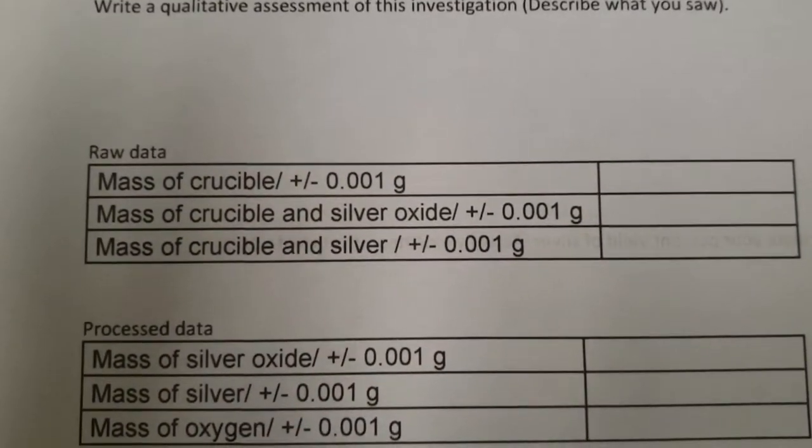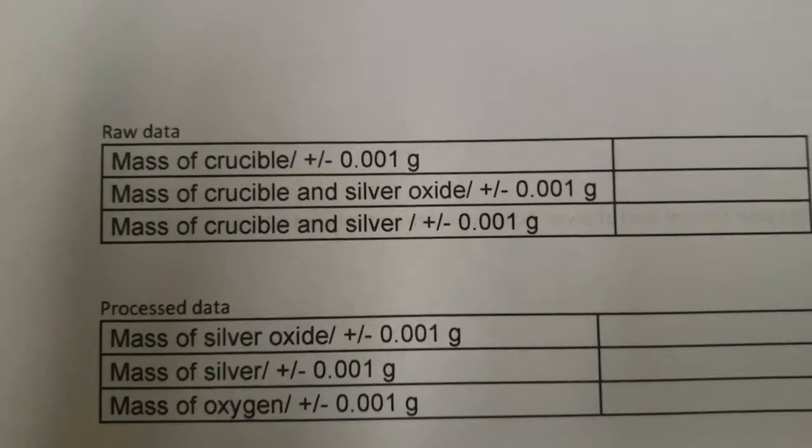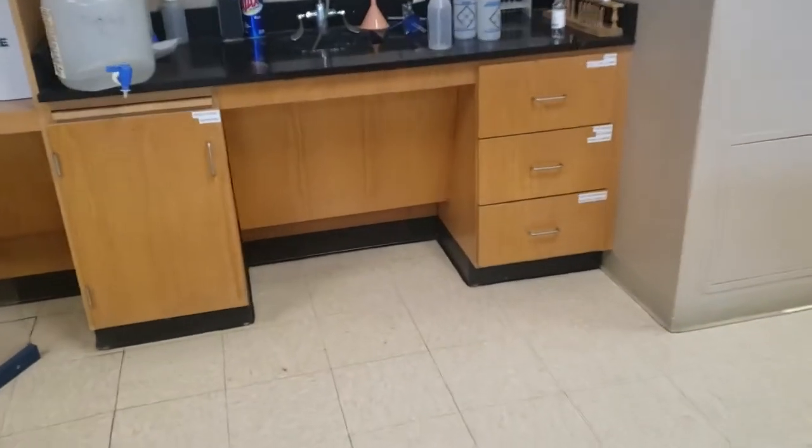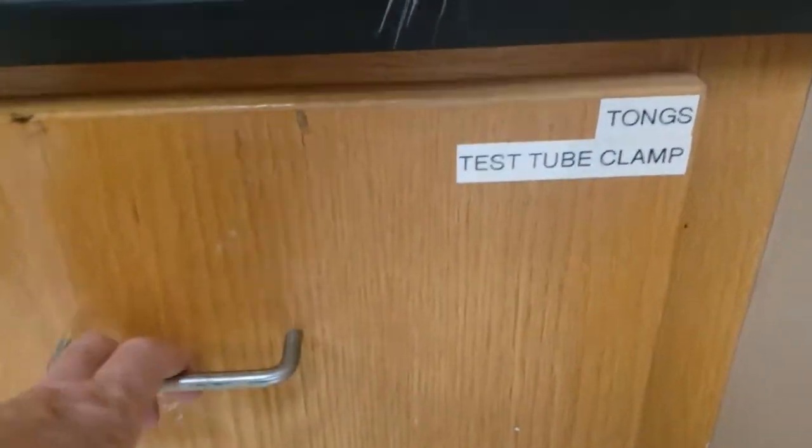Of course, something to light the burner with. We're going to collect three pieces of raw data today: mass of the crucible, the crucible with silver oxide, and the crucible with the silver. In our lab, this is where things are located.